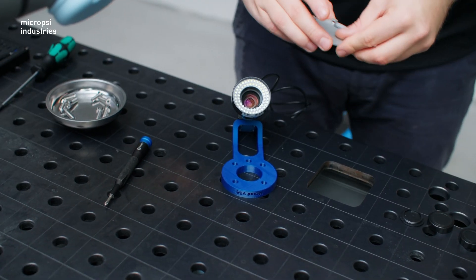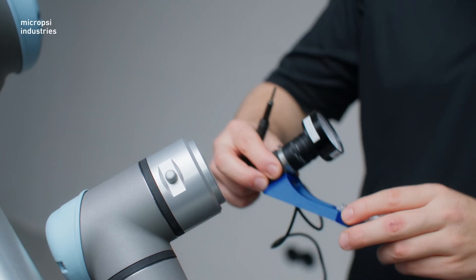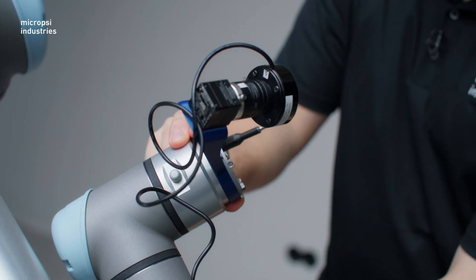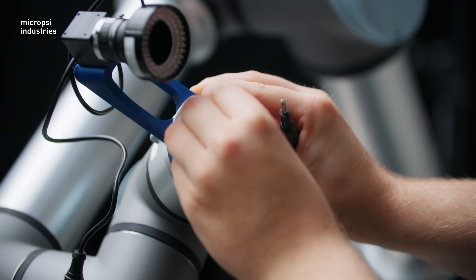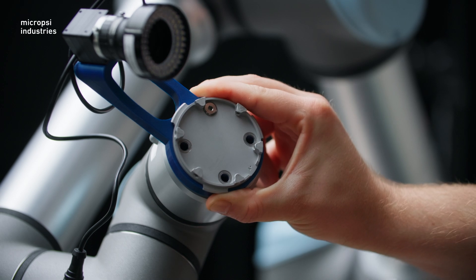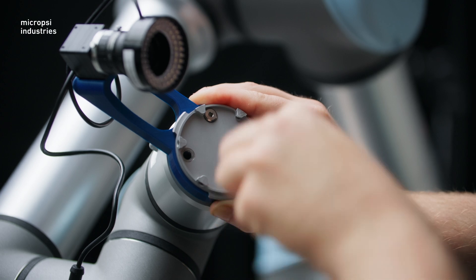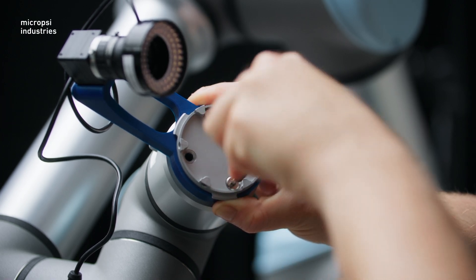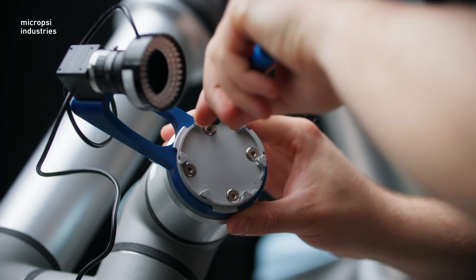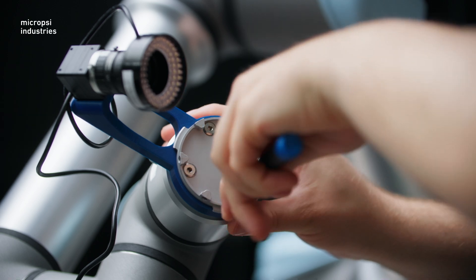The next step is to attach the force torque sensor's base plate to the camera mount. Now we can add this to the flange. The camera mount has a through hole that should match the hole on the flange. Use the supplied screws to fix this into place. Make sure these screws are tight — the camera shouldn't move after installation, and these screws are hard to reach later on.